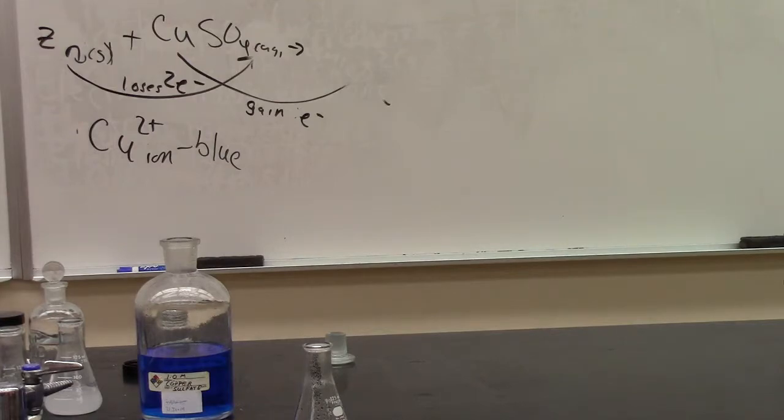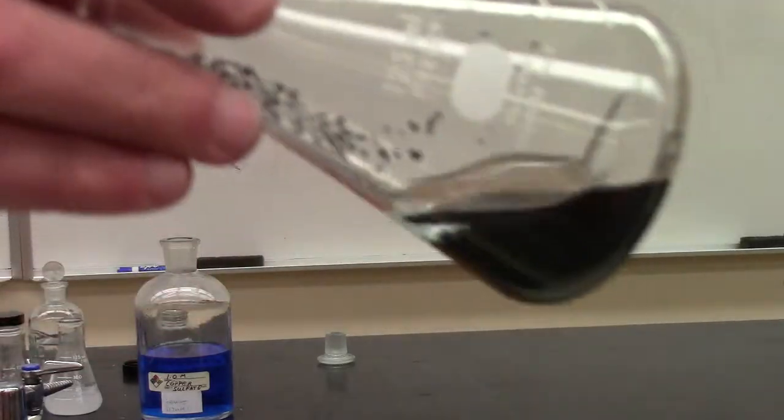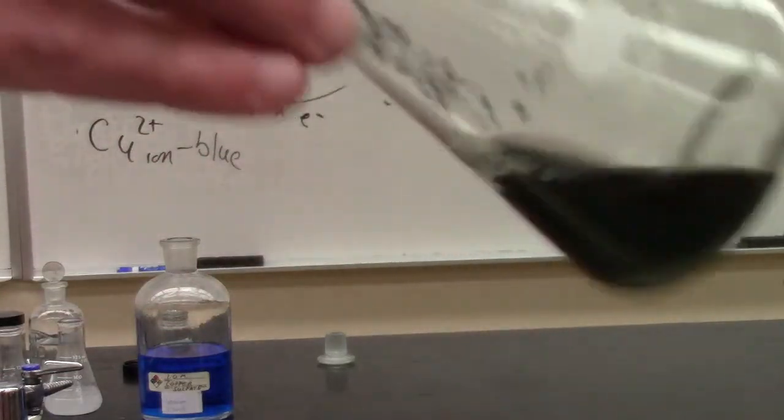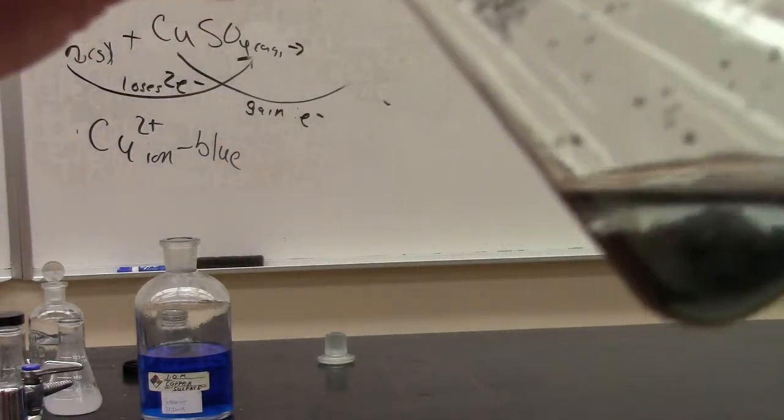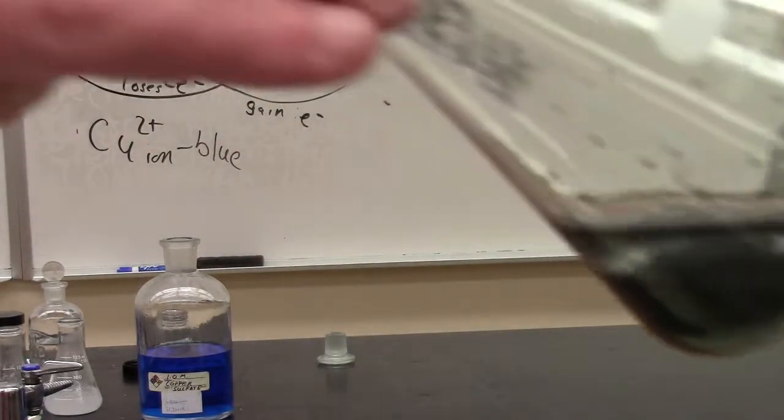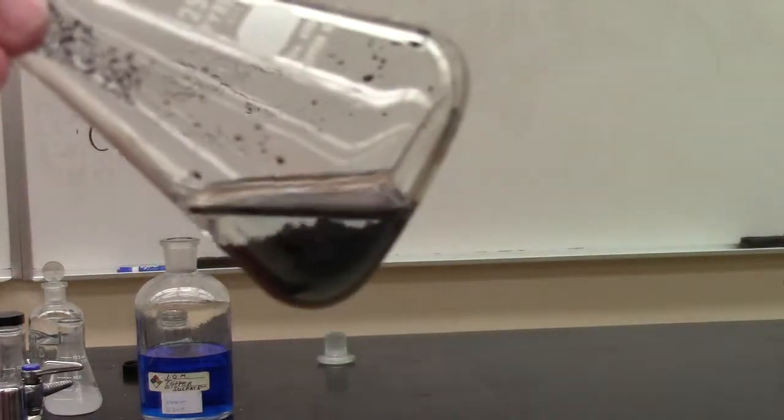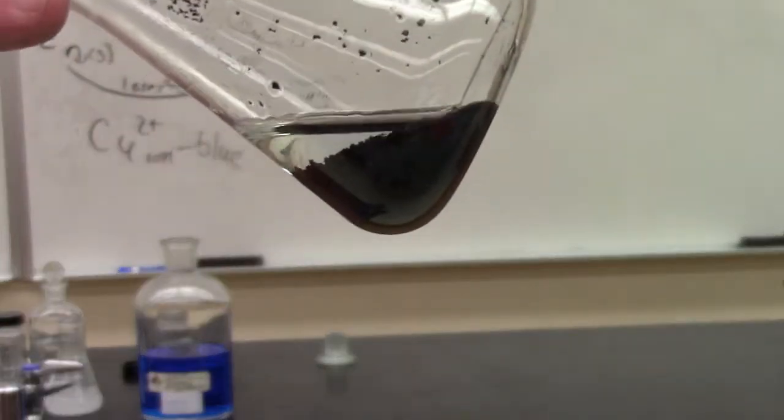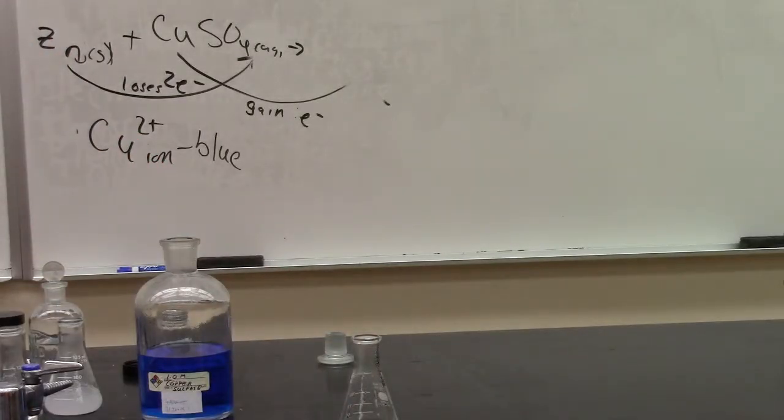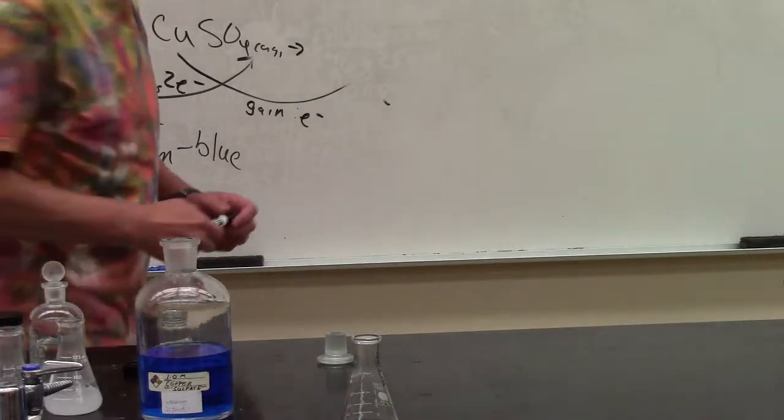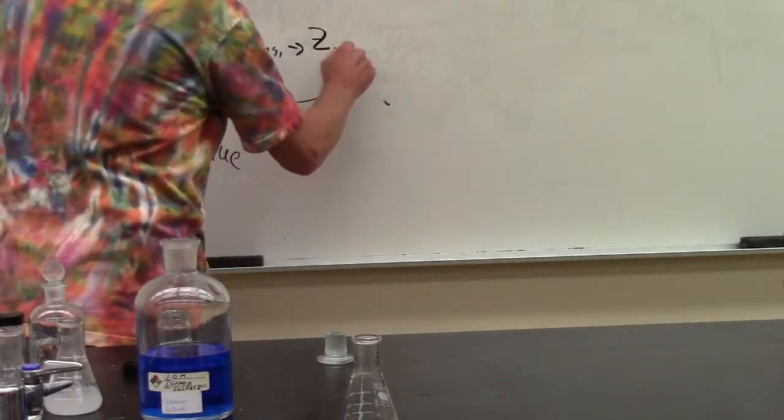What we'll see here is that the solution is almost colorless. The blue copper solution has gone away. And if you look closely, that zinc is no longer shiny silver, but it's kind of got a little brown on it. See that? Look at that liquid, almost no blue. That tells us the copper ion is no longer there. And that brownish coating on the zinc that's no longer silvery is actually copper solid.